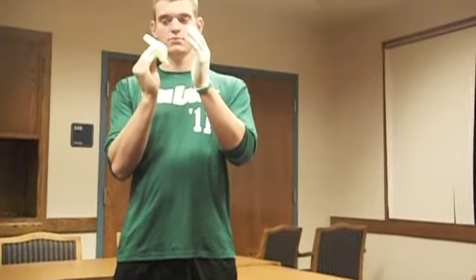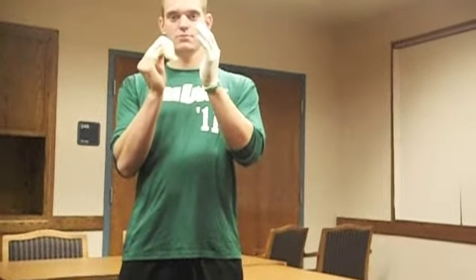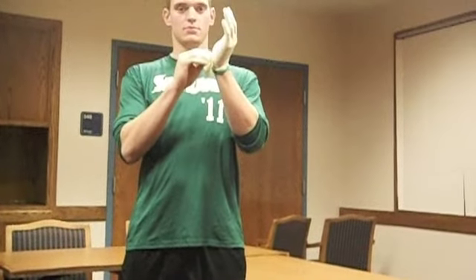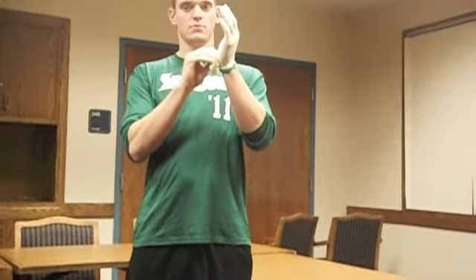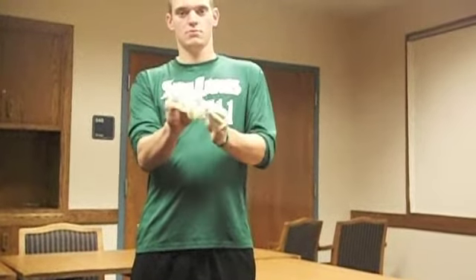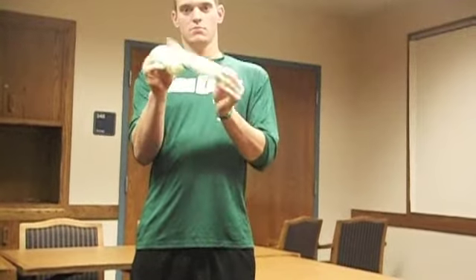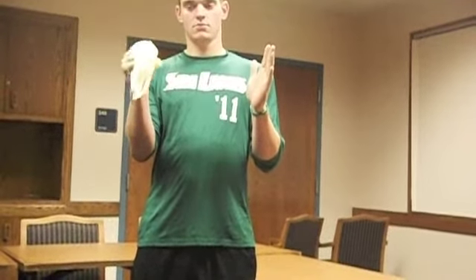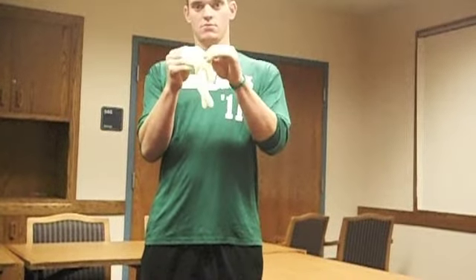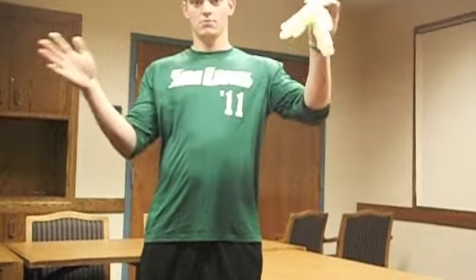After this is complete, with the still covered fingers of the first glove, grab the second glove near the wrist. After this, pull the second glove completely off, but keep it grasped in the fingers of the first glove. With the uncovered hand, now grab the inside out part of the glove and pull it off.